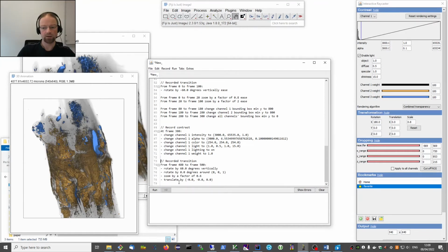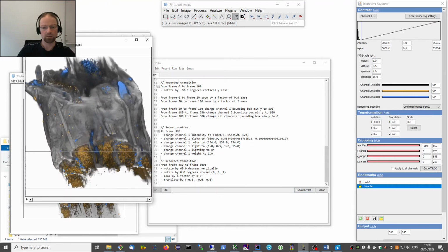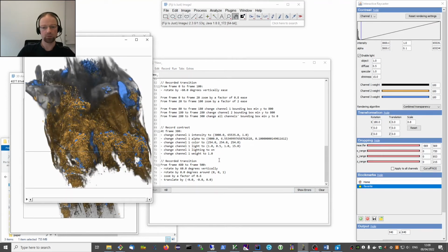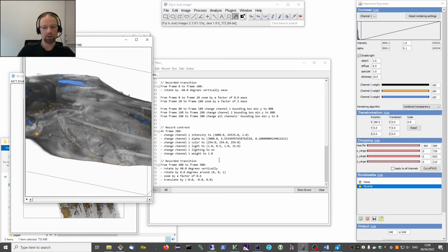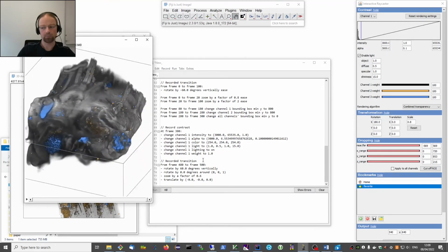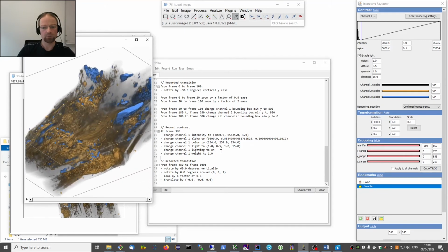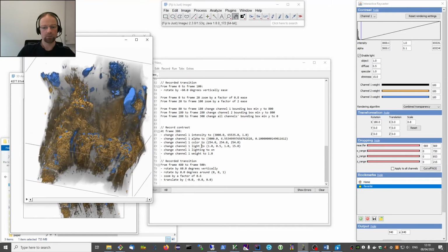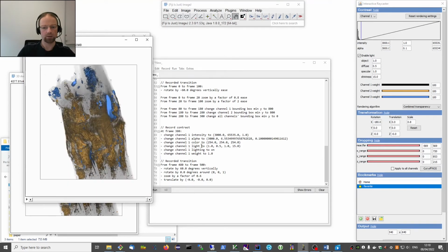So this is our final script now, and I will run it once more. You see, that's everything we had before. We do the cropping of the second channel. They come back, we rotate. In the middle of the rotation it will switch to transparent. And once the rotation is fully done, like now, we'll move it back to the initial orientation. So this is it basically.